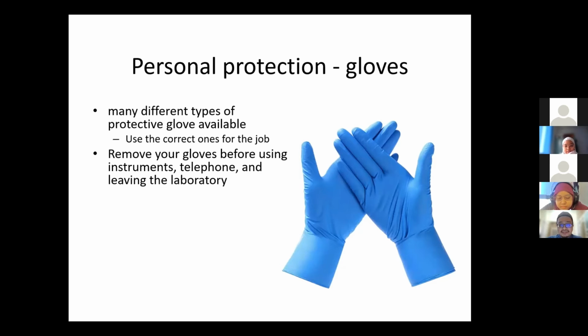So it is about the definition of the correct ones ni. Itulah yang memerlukan pentafsiran. What is correct for you? What is correct for that job? Okay, some jobs like if you are doing smear, if you use a very thick glove, it won't help. Yeah, you need a thinner one.